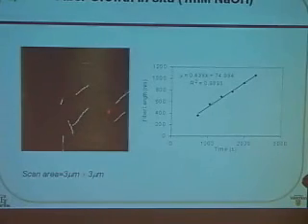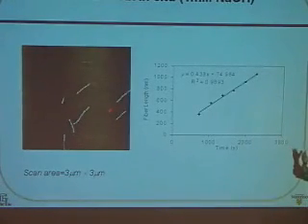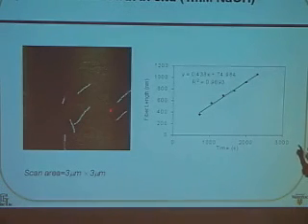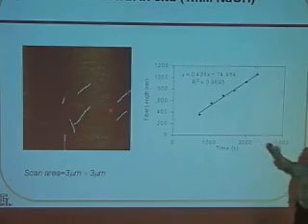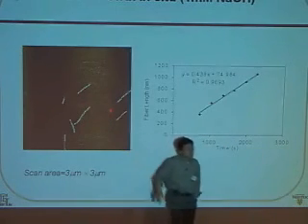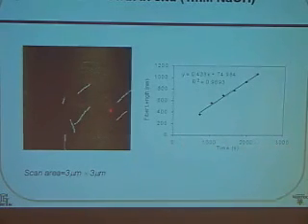Now, the advantage of using AFM, the atomic force microscope, is that you can do it very differently from a conventional microscope such as EM, the electron microscope. There you can see nanometer scale features, however you have to put your sample in high vacuum. In our case, we can leave it in any environment and simulate physiological situations. Here we do it in liquid, and we can see the fiber dynamics, how it grows, how it generates the network.